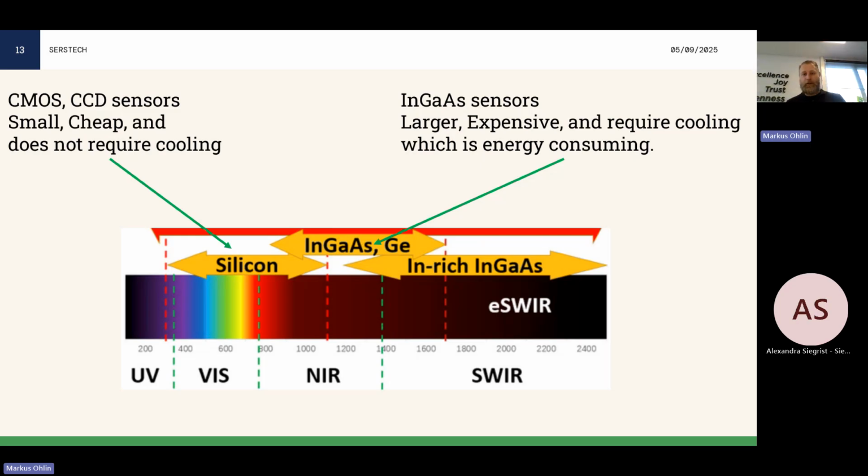Behind a fridge, there's a heat source. And it could be the same thing for some of these spectrometers, that the actual spectrometer gets overheated when you cool the sensor, which can make it difficult to hold when it's a handheld device. And of course, it requires a lot of energy.